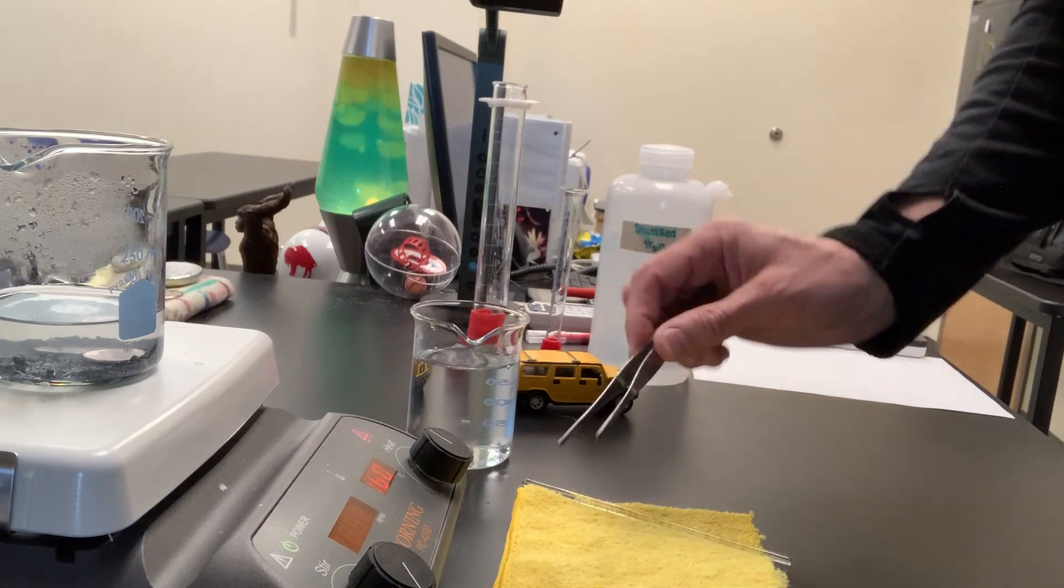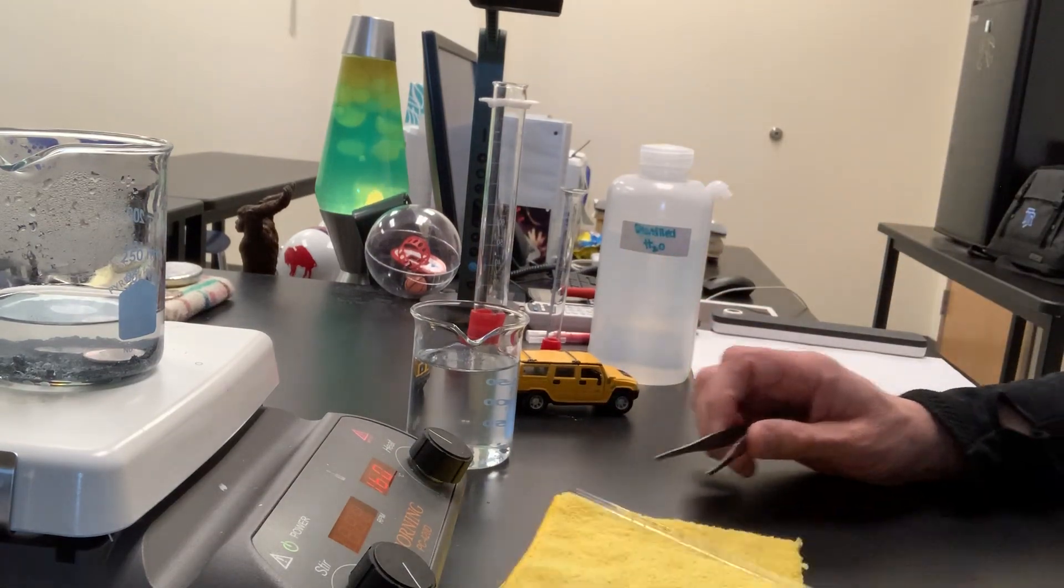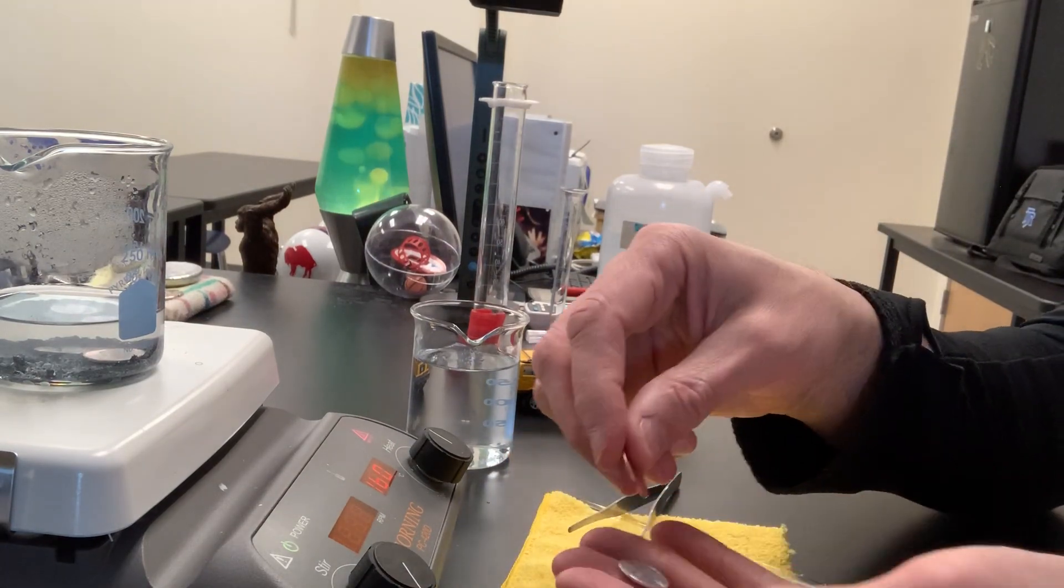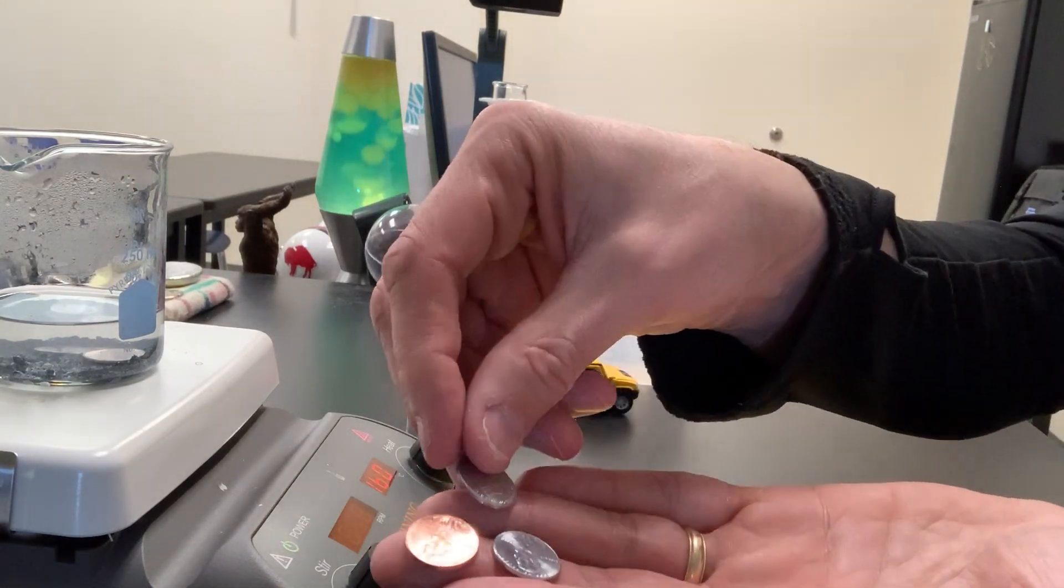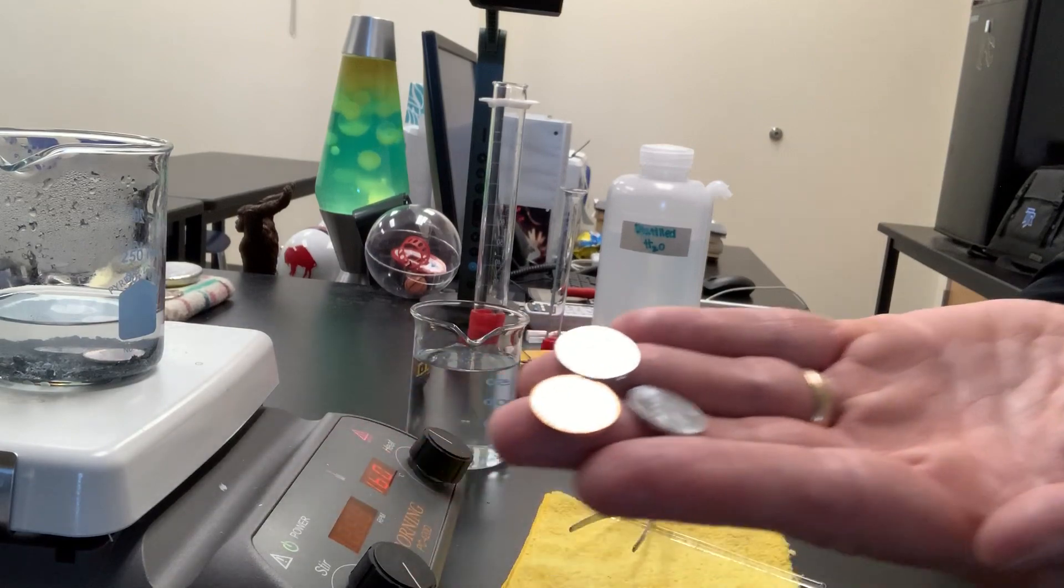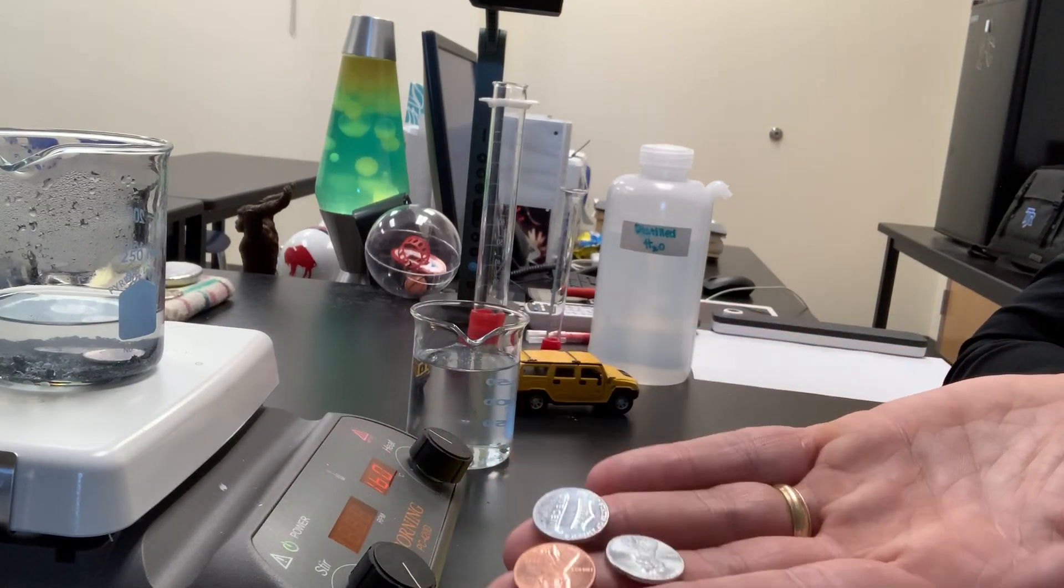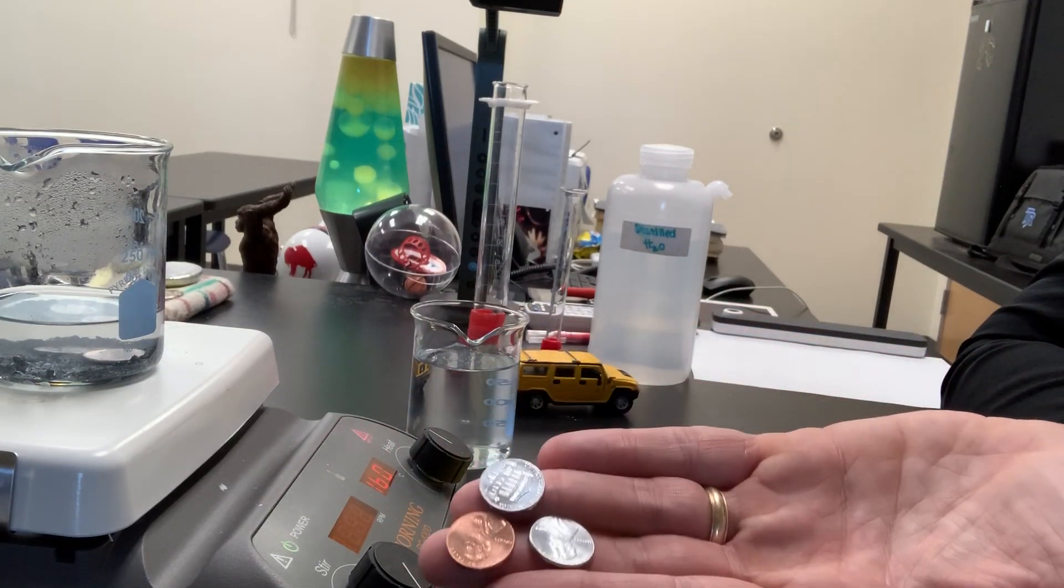I'll rinse the second one off and dry them just a little bit. When I take these out you can see there's the original copper penny, and then these two have been plated with some zinc. They appear to be silver. They almost look like dimes, don't they?